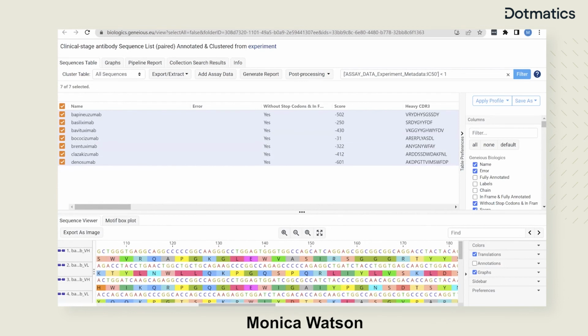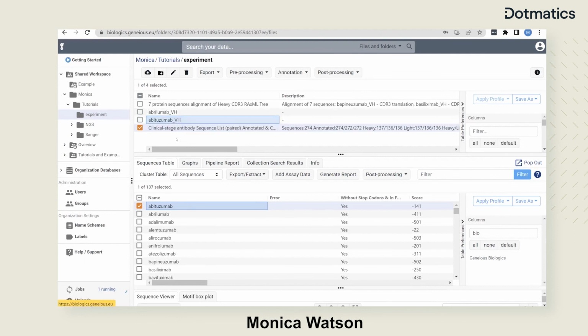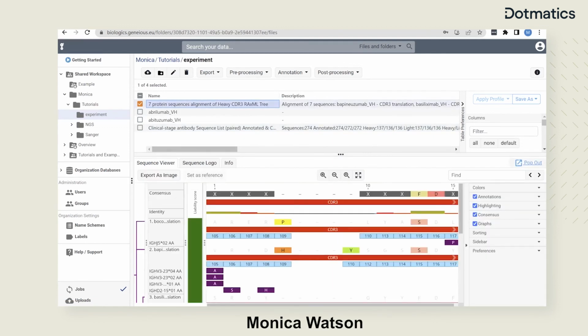And when you run a job, all of this is performed on the AWS servers, so it doesn't use your native computer hardware. You can walk away, you can close this tab, you can grab a coffee and it'll be done. So you can see it popped up here. Let's take a look. Let's pop it out again.